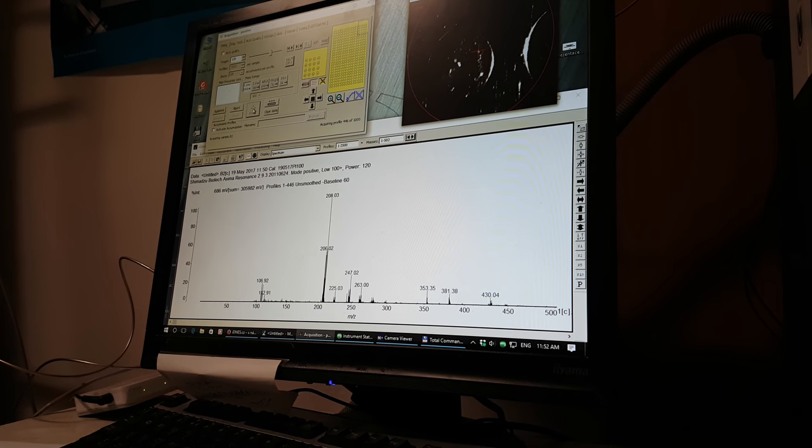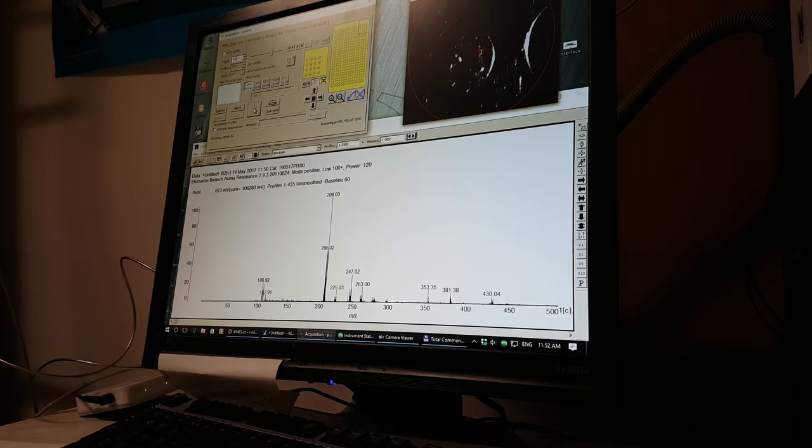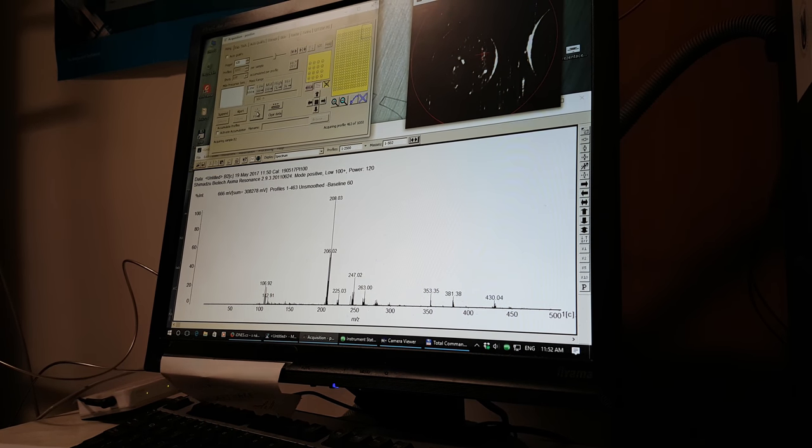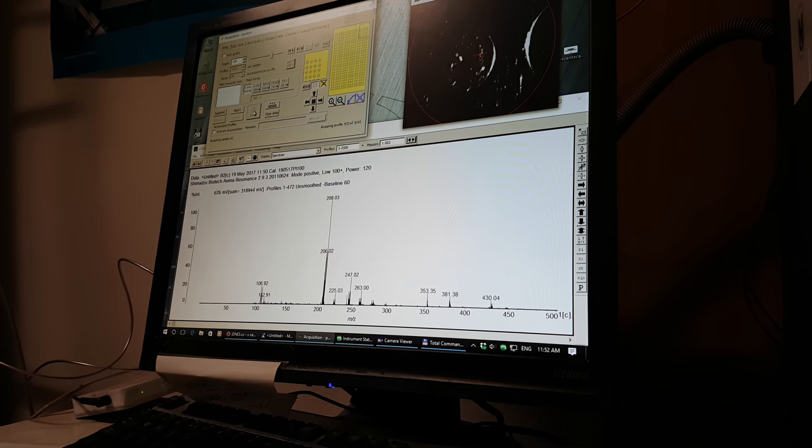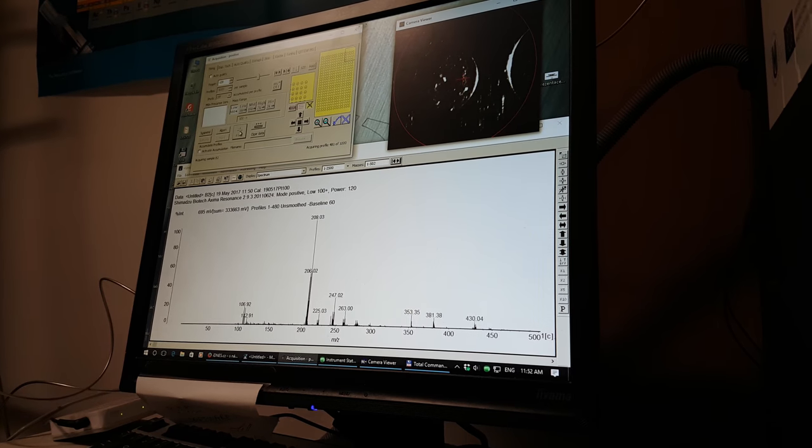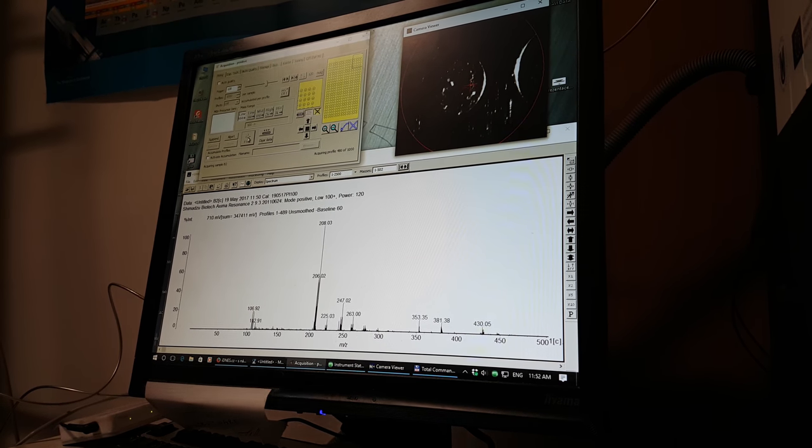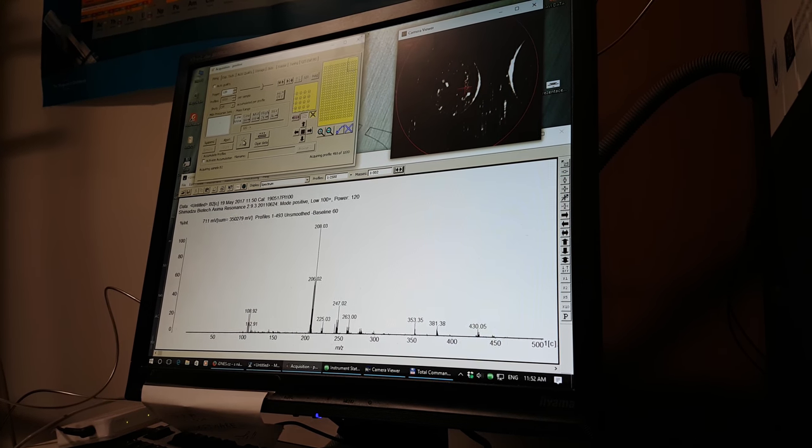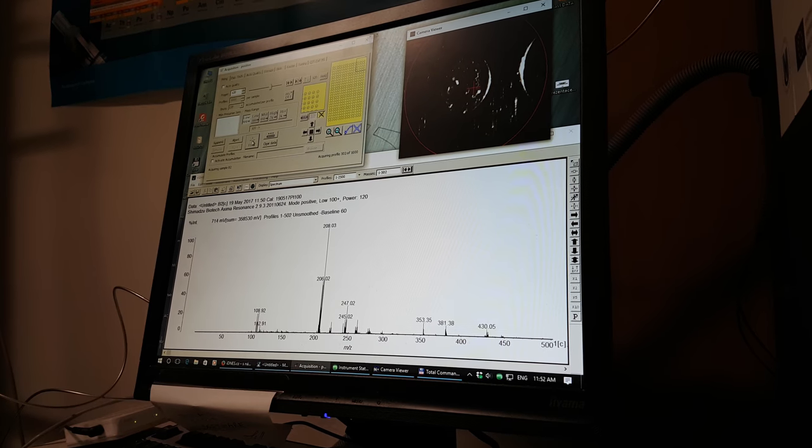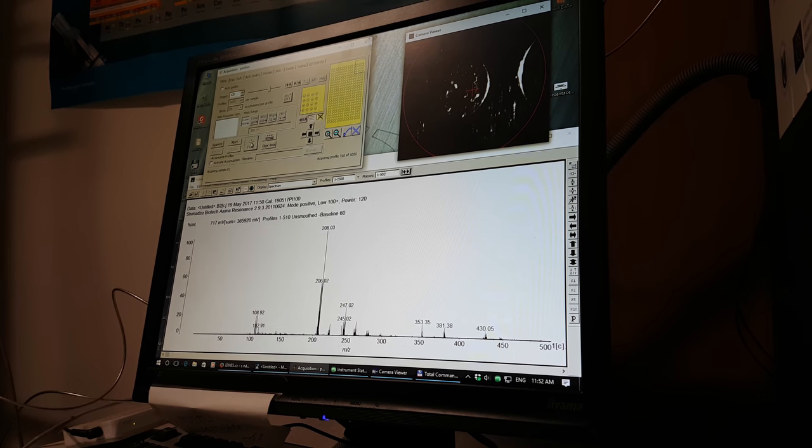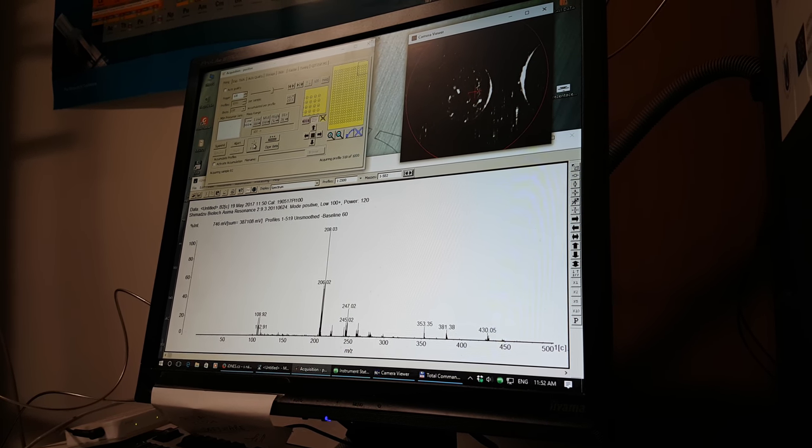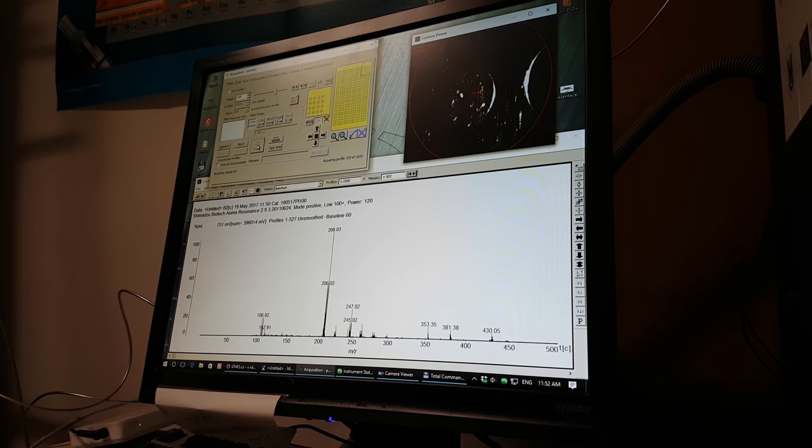Red phosphorus is better to keep separated from other samples because of possible contamination. The machine mills out anything that comes off the sample holder.